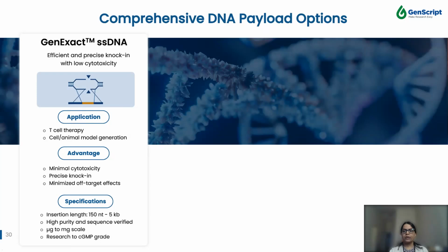One powerful application of CRISPR-Cas genome editing technology involves precisely inserting DNA templates through the HDR pathway. And selecting the suitable HDR template is very critical.